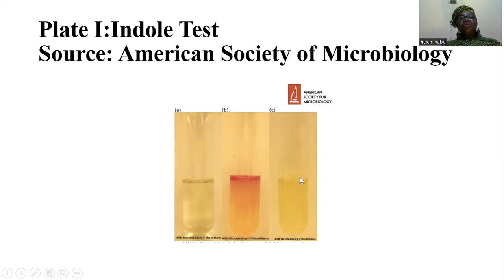And the third tube shows a negative indole test where there is no red color in the reagent layer. This image was obtained from the American Society for Microbiology.